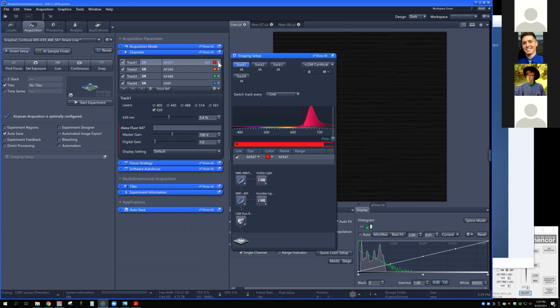this is all personal preference, this part that we're talking about here. So regardless, here is what this configuration looks like. And you'll notice that we have kind of a slider here. And it is worth mentioning, I'm just going to save this right now as your Airy SR configuration.